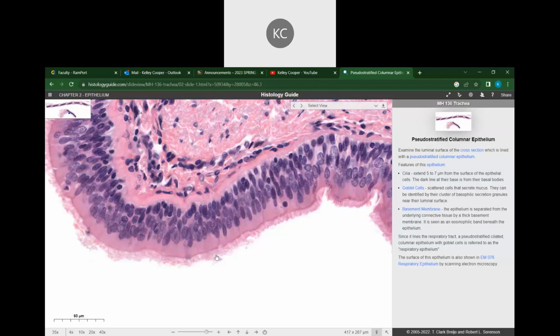You can swallow it or you can choose to spit it out, right? So in this case, the mucus is going to serve to trap dust and debris and foreign cells and pathogens and bacteria that we inhale, and then we can work those things up and we can get rid of them in the body. So this kind of border that you see here, this is not microvilli, but this is cilia on the apical surface, all right?